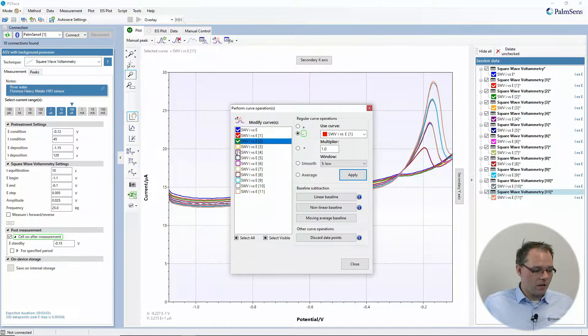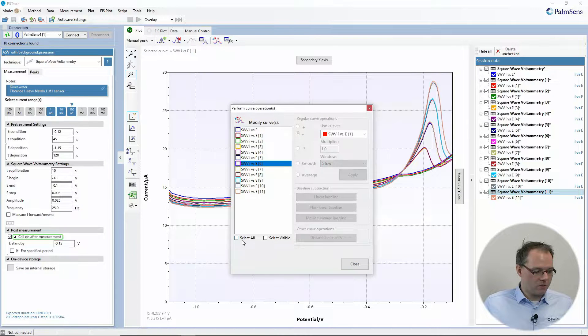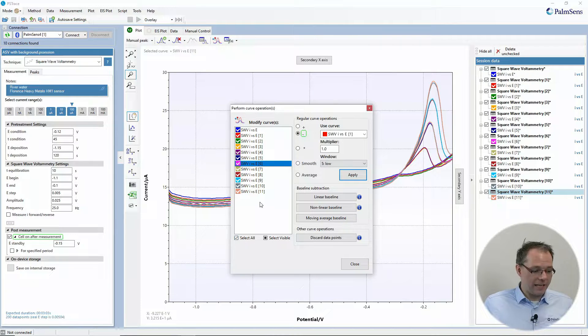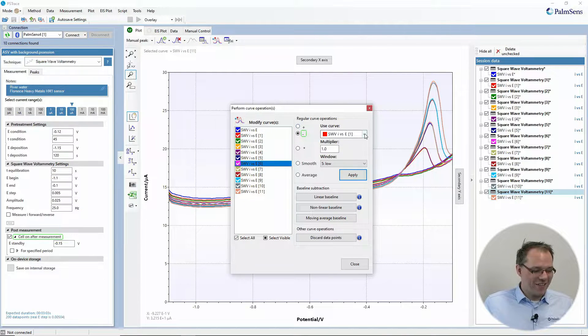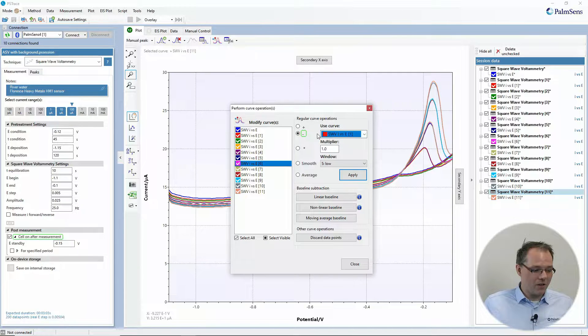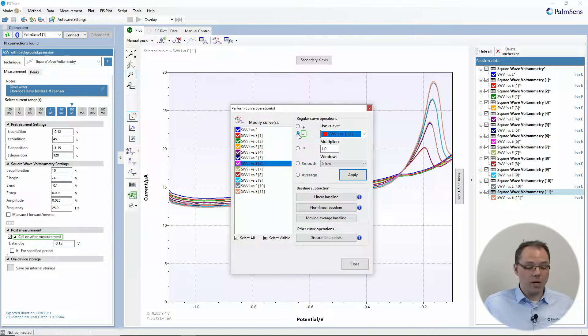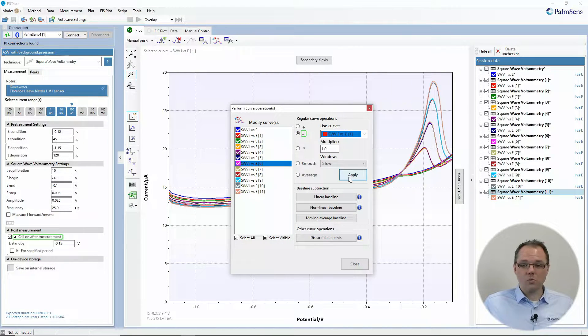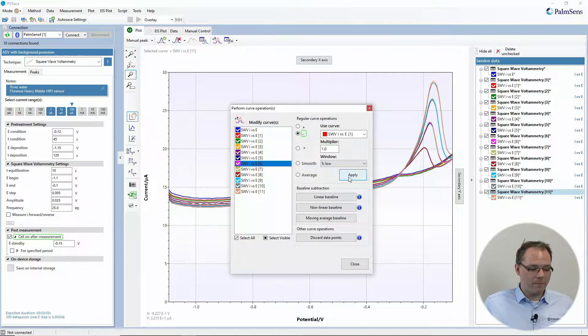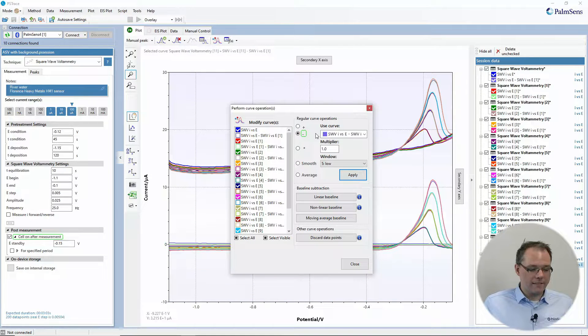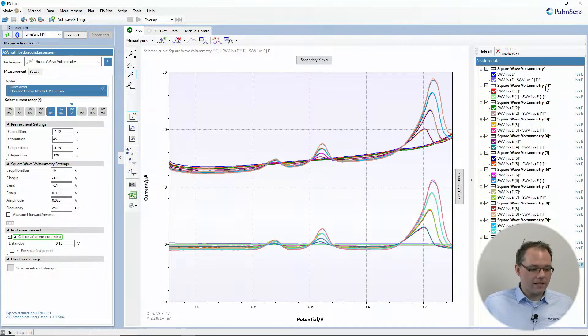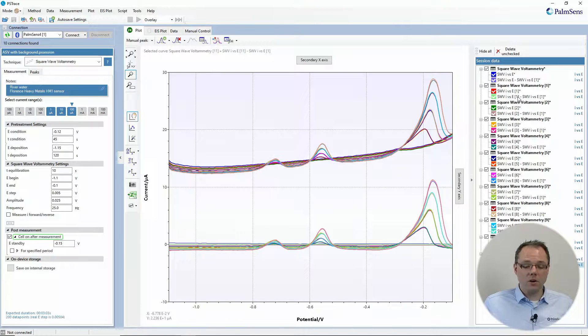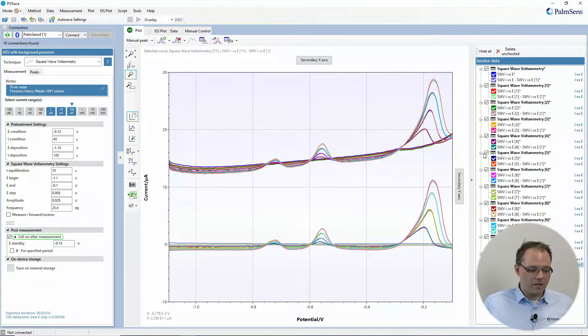So I can just select all of them, then I choose the red curve, I choose to subtract and then I choose apply. Then this operation is executed and you see that each curve now has a second curve that says the curve's name minus the red curve.